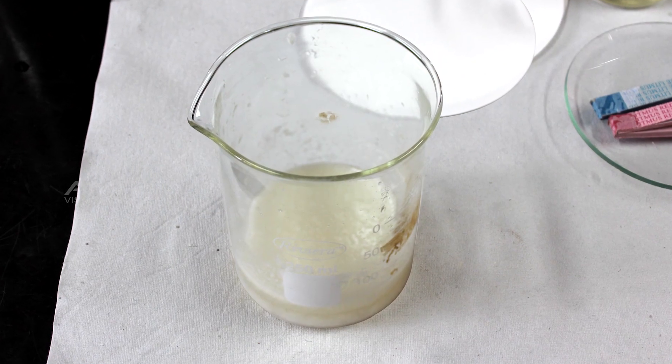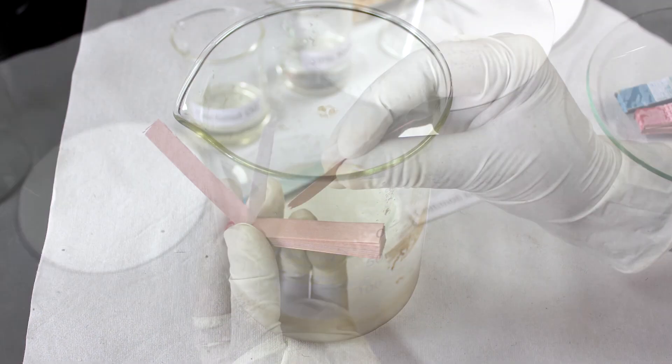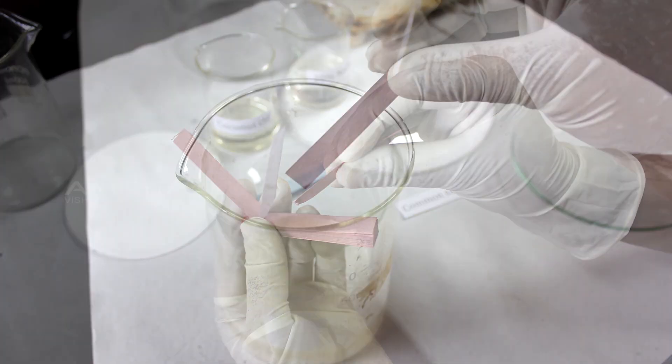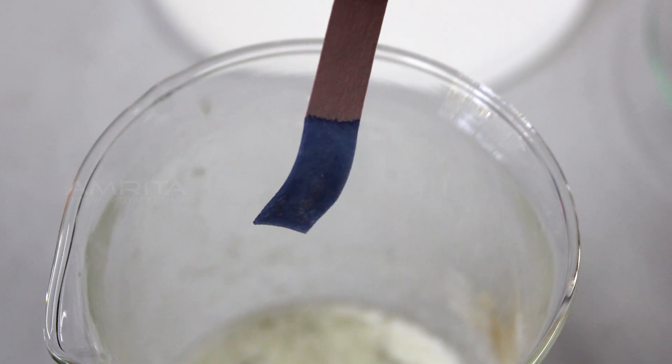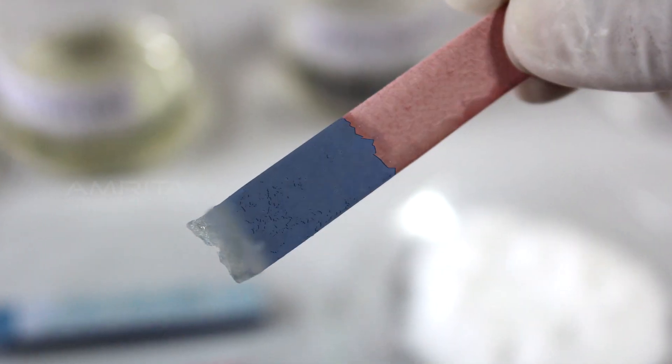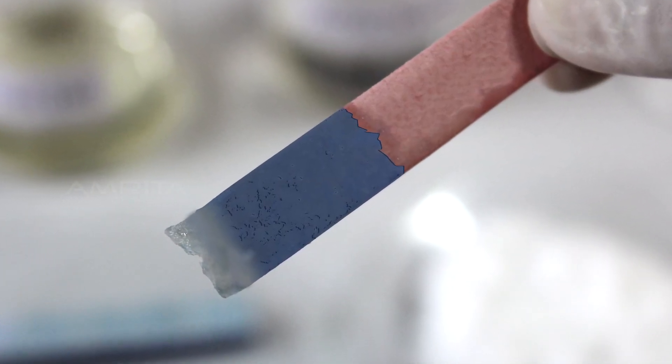Remove the beaker from the flame and allow it to cool. Take a red litmus paper and dip it in the suspension formed. Red litmus paper changes colour to blue indicating that soap suspension is basic in nature.